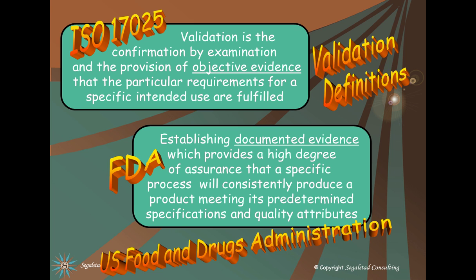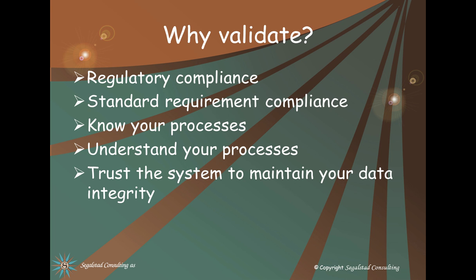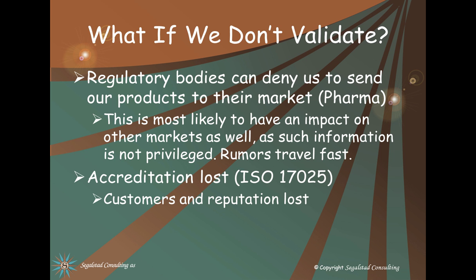I will now talk about how to validate IT systems, regardless of which standard you have to comply with. Why validate? The standards state that validation of your processes are needed. IT systems are part of these processes. However, the more important issue is not actually what the standards say and the requirements are, but the fact that you need to understand your processes and trust the system to maintain your data integrity.